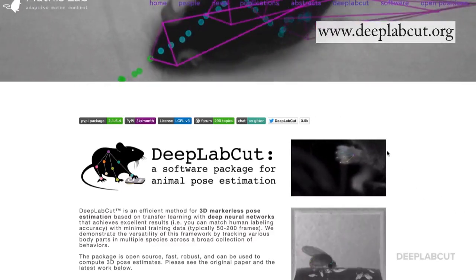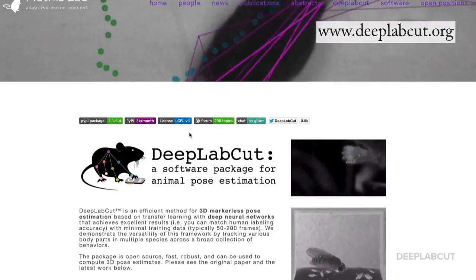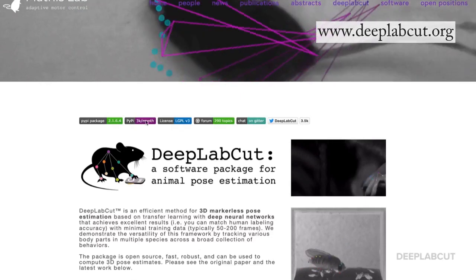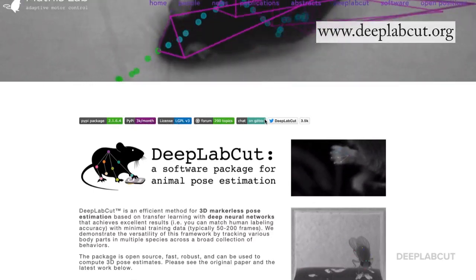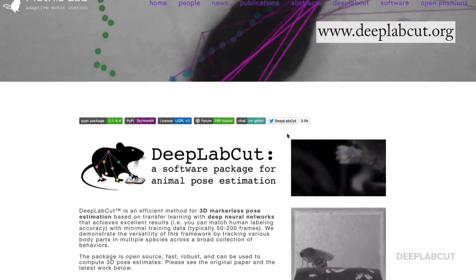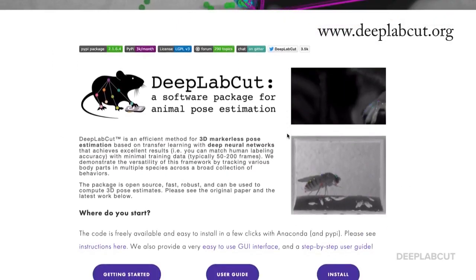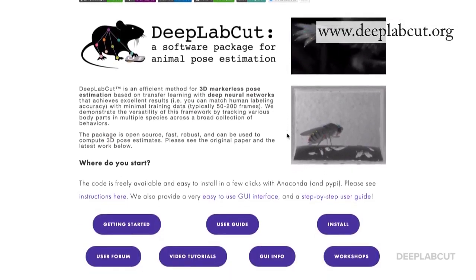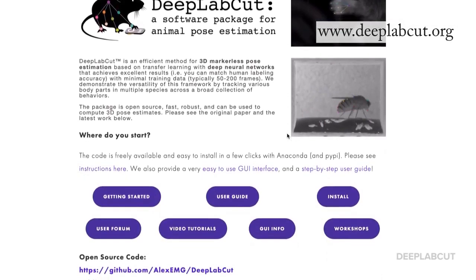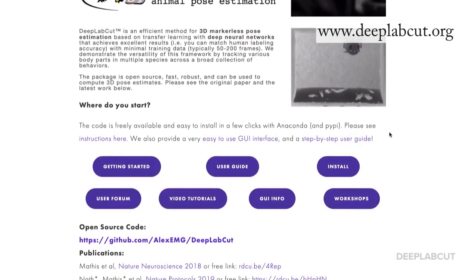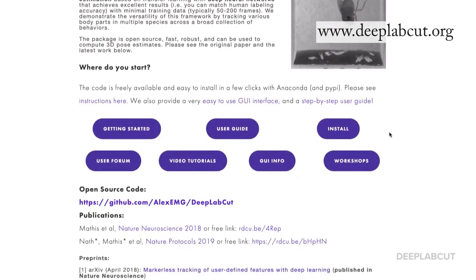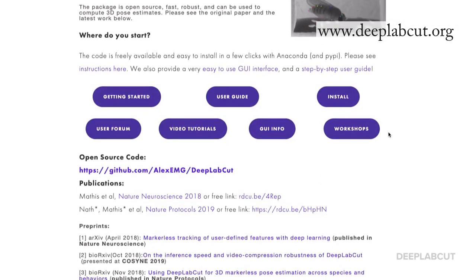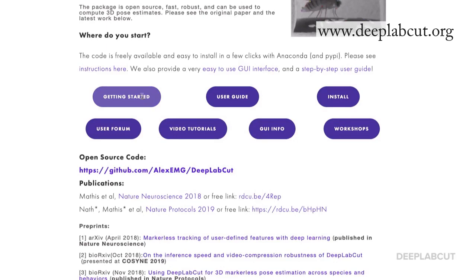Hi, DeepLabCut users. Welcome to our latest tutorial on guiding you through the documentation. We're starting off at www.DeepLabCut.org, where you can find most of the information about the code, how to install it, where to get started, user guides, and papers.